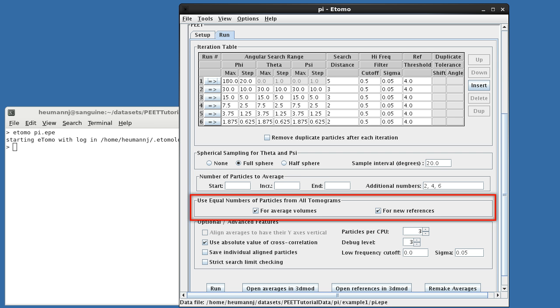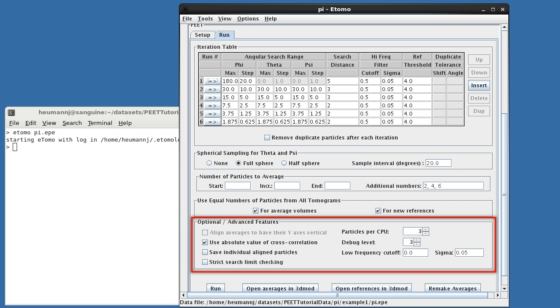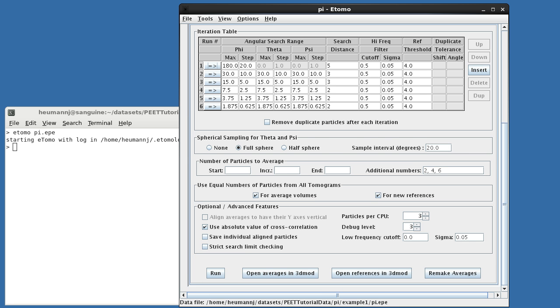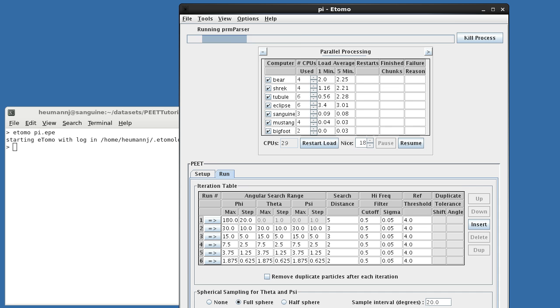Because we're using multiple volumes, we've told Pete to prefer equal numbers of particles from each volume when creating averages or references. In more realistic examples, this can help minimize bias in the results. Finally, there are a series of optional and advanced features, which are described in the online guide, and won't be discussed here. With the settings complete, we can press Run to start the alignment.